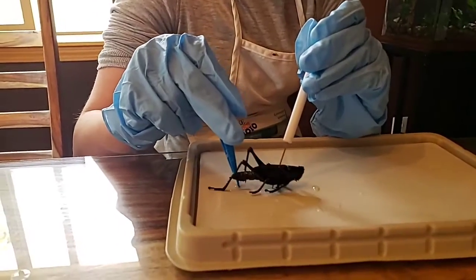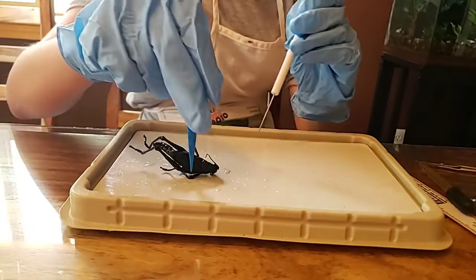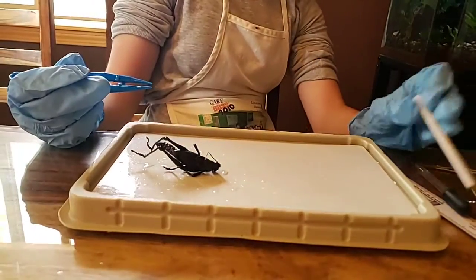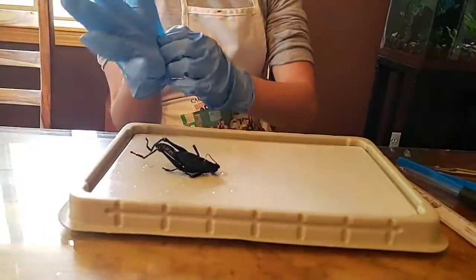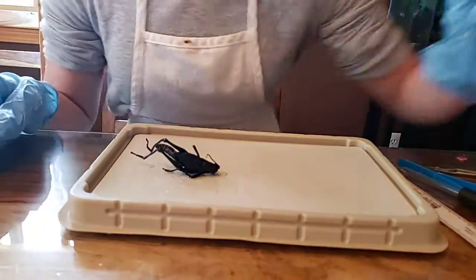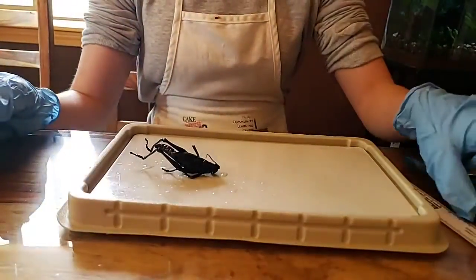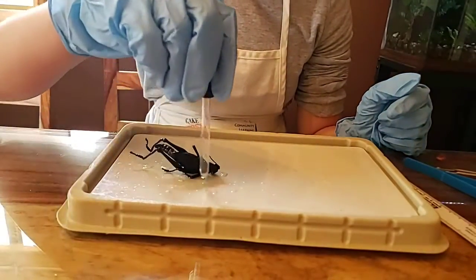Make sure the camera stays up. All right. So, you guys have your protective gloves on? Check. You got your tools ready? Check. And you are ready to begin? Yeah. Okay. So today we are going to be doing the dissection of a grasshopper.